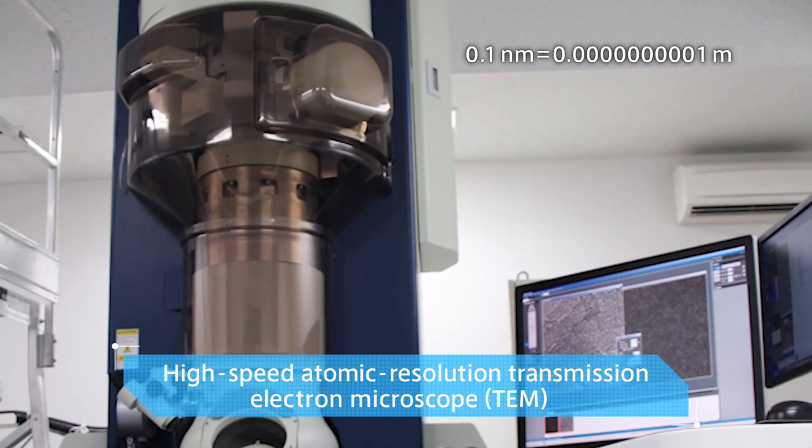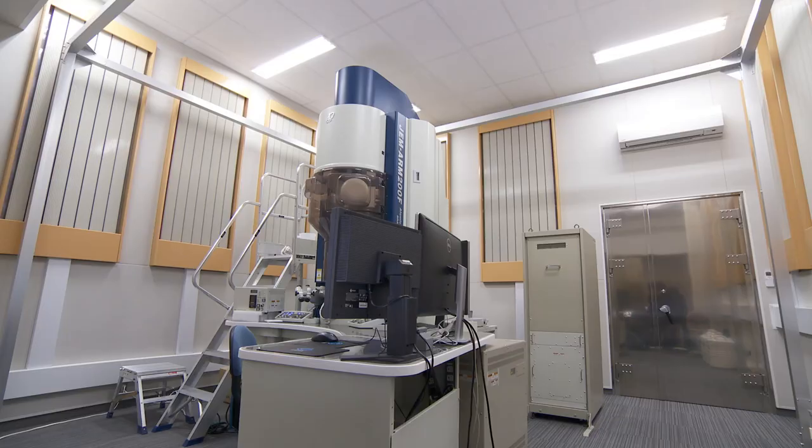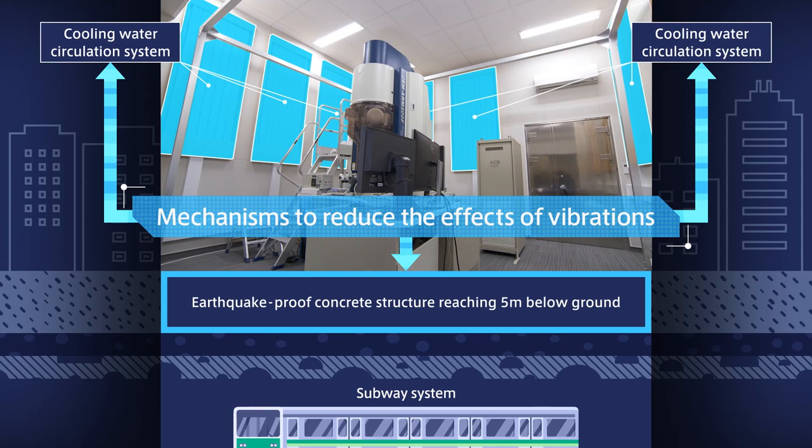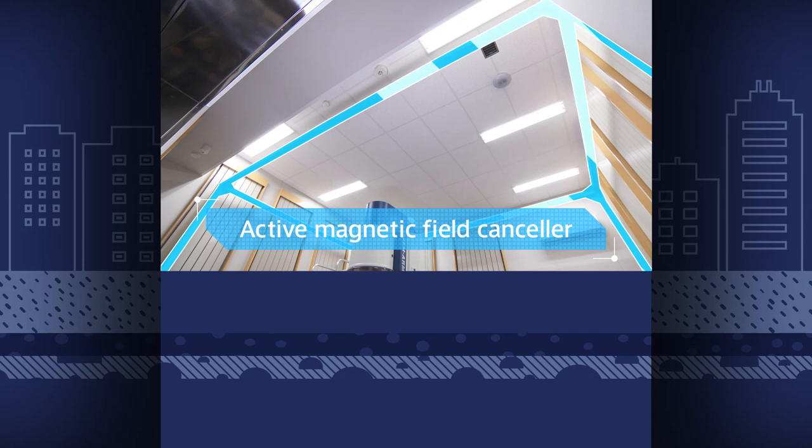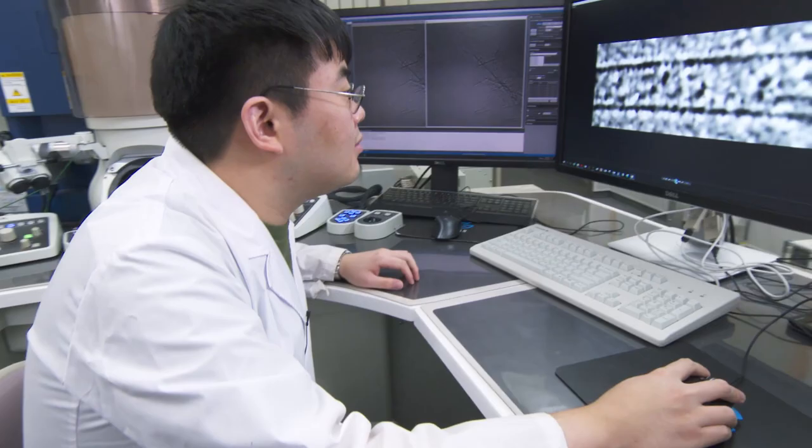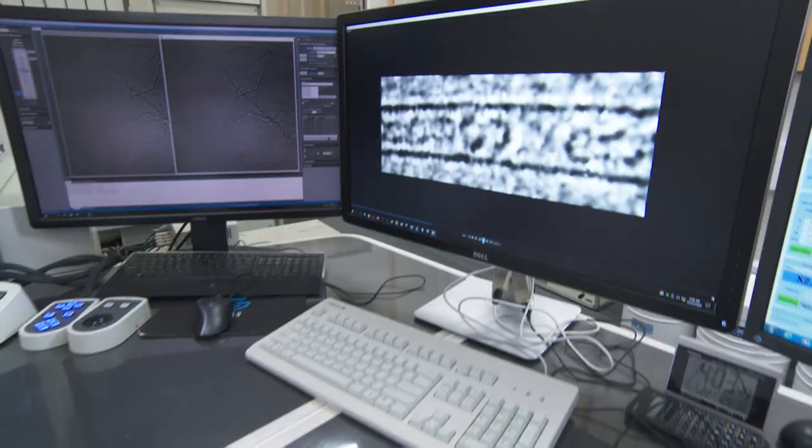In order to ensure that the electron microscope functions accurately in this room, we need to minimize external influences such as vibration and magnetism. Also, image processing technology has been developed to enable the video to be filmed at high speed, so it can be seen clearly.